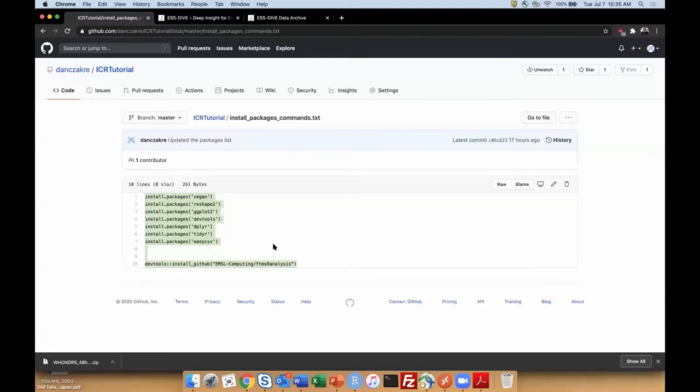Regarding some questions, yes, as James says, there are going to be a lot of zeros in this data set. That's because a lot of masses have no associated molecular formula with them, and there are a lot of reasons for that. That could be that there's database limitations. We certainly don't know all of the different combinations of organic matter that exist. It could be that they do contain other elements that we don't know.